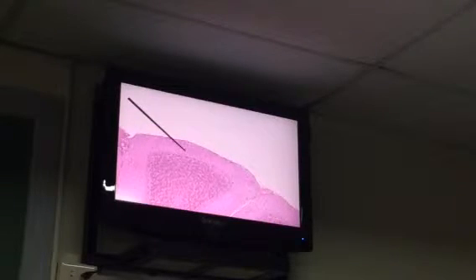Now, again, we divide your cerebellum into your cerebellar cortex from this point. Of course, the outermost again is your pia, the only meninx seen in this slide. And this is now your cerebellar cortex from this point to the dark area. The inner portion, which is whitish, this is now your cerebellar medulla.